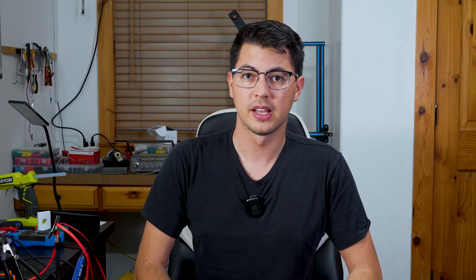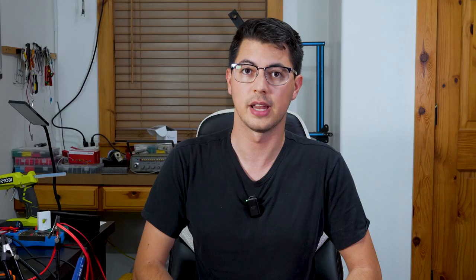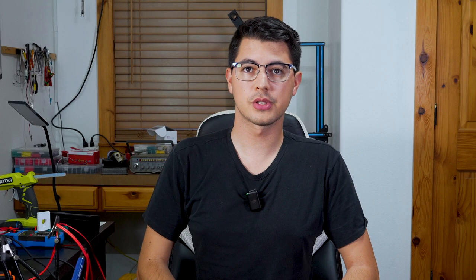Why use a laser though? Why not just a regular old flashlight? The answer is spatial coherence. Laser light is coherent, meaning that all of the light waves are in phase. When these light rays are focused to a point, they do so constructively, allowing for very sharp focus and a clear projected image. A flashlight does not have coherent light, and thus produces a very fuzzy shadow, which you can see here. No microscope test is complete without a drop of pond water.